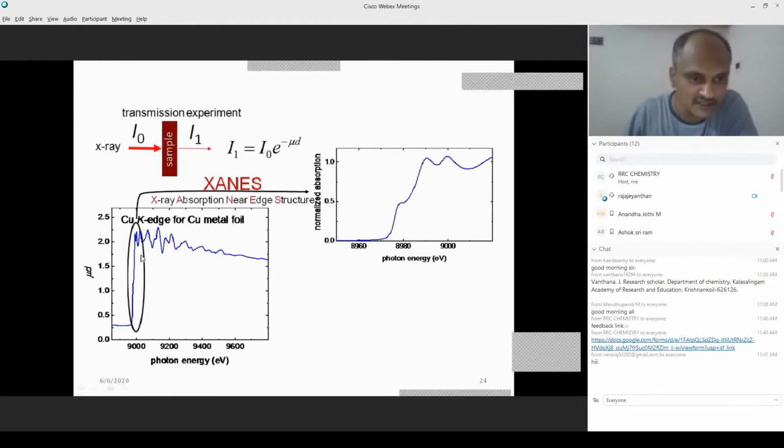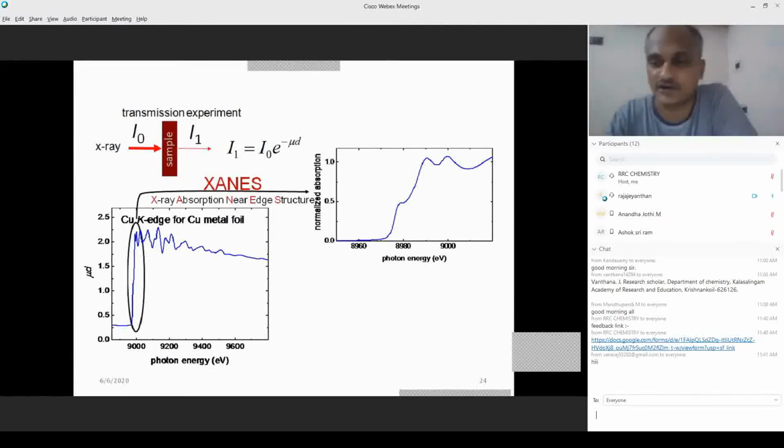So this is associated only with the region close to the edge. That's why the spectroscopy is also called near edge. What is happening near the edge is monitored by using this NEXAFS spectroscopy, and you can see a clear spectrum because here the electrons are not ionized, no photoelectrons are created, so the molecule remains neutral and you can get a clear spectrum.